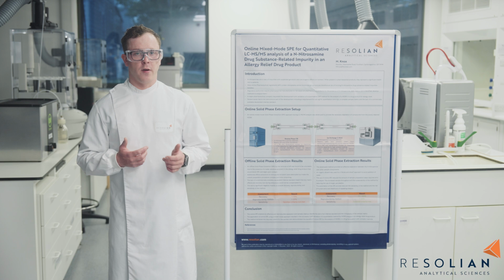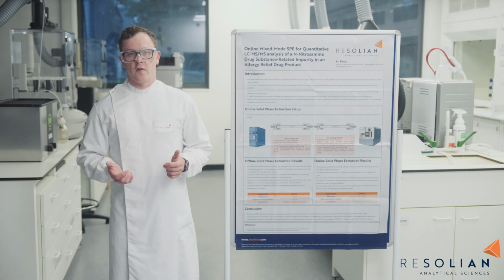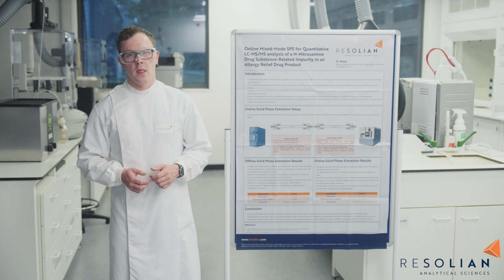This used an offline SPE cleanup step to remove the API from the sample solutions containing an aqueous diluent prior to the injection on a Z-HILIC column. Applying the same offline SPE process was found to be unsuitable due to the presence of croscarmellose sodium in the allergy relief drug product. Upon contact with water, it rapidly swells to 4 to 8 times its original volume and therefore renders the existing SPE cleanup process of aqueous solutions impossible to perform.